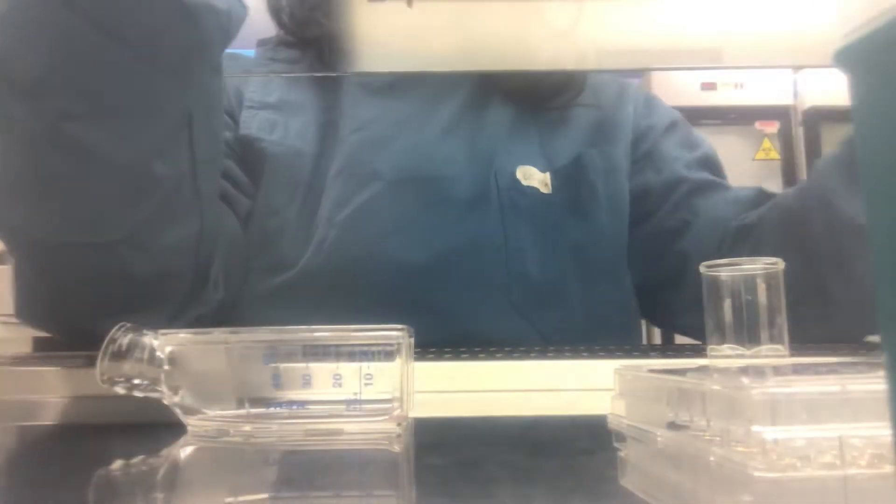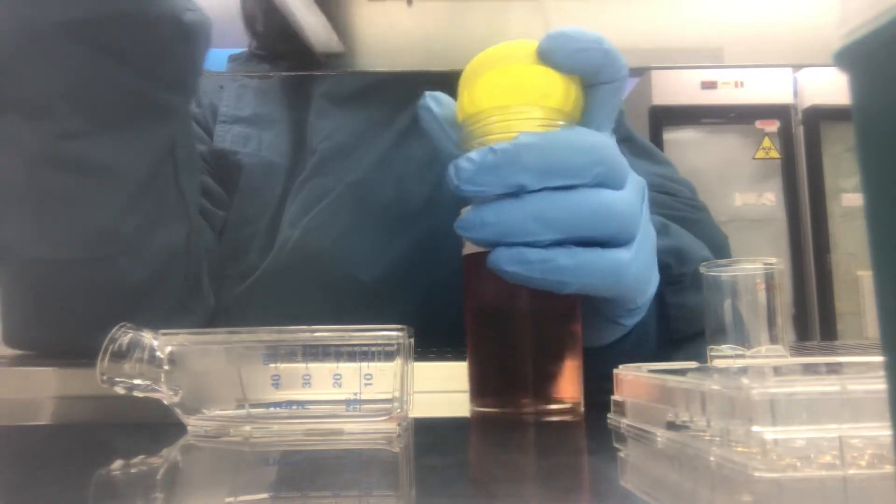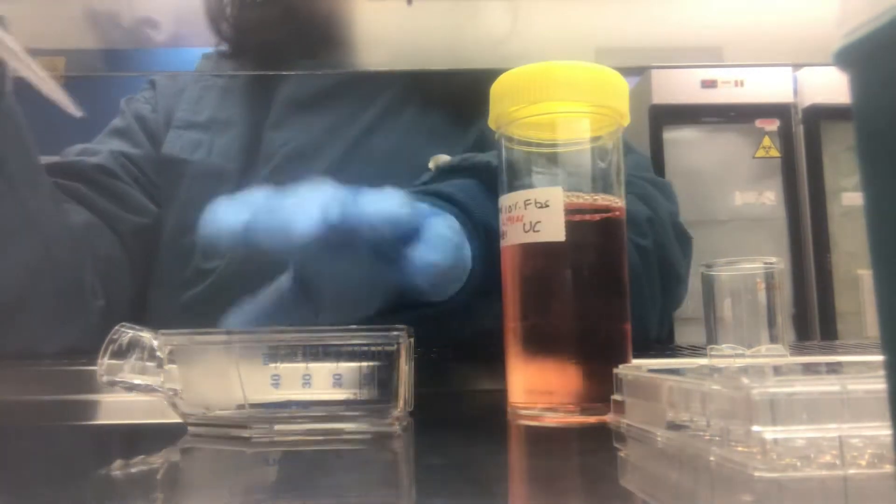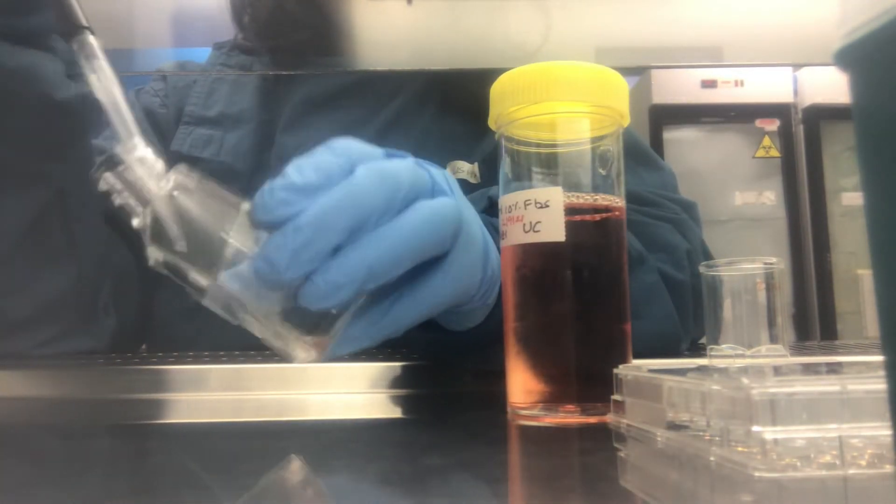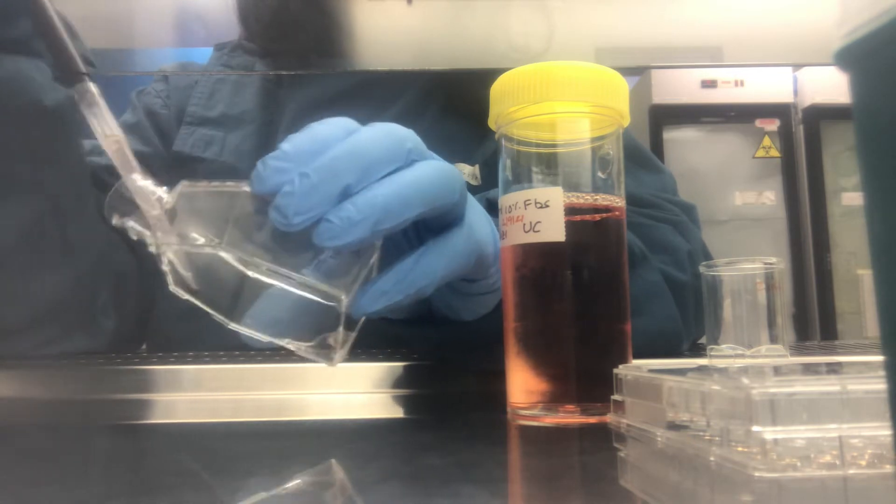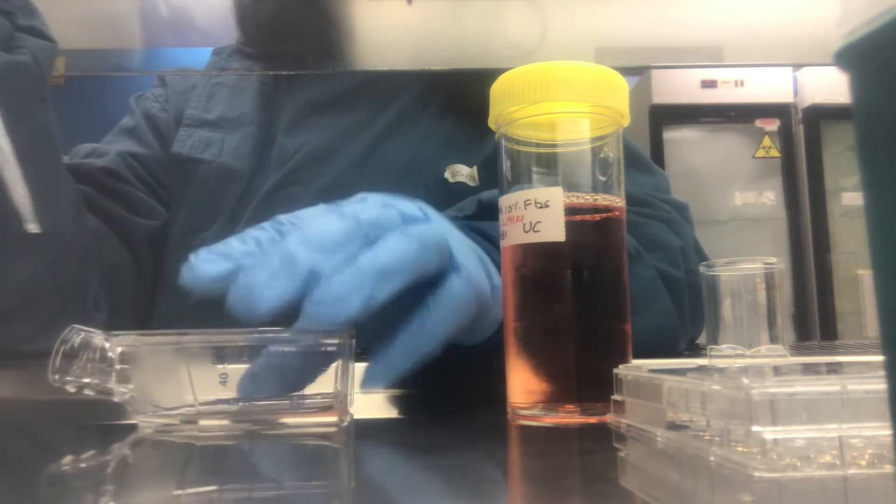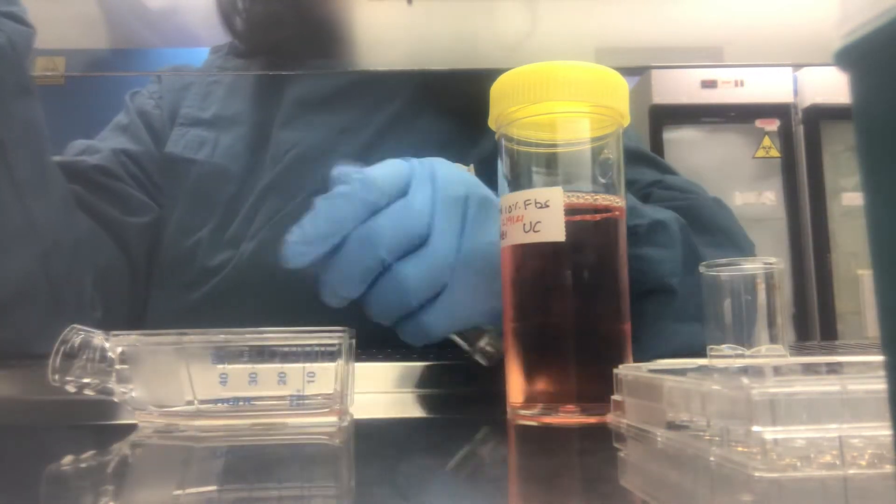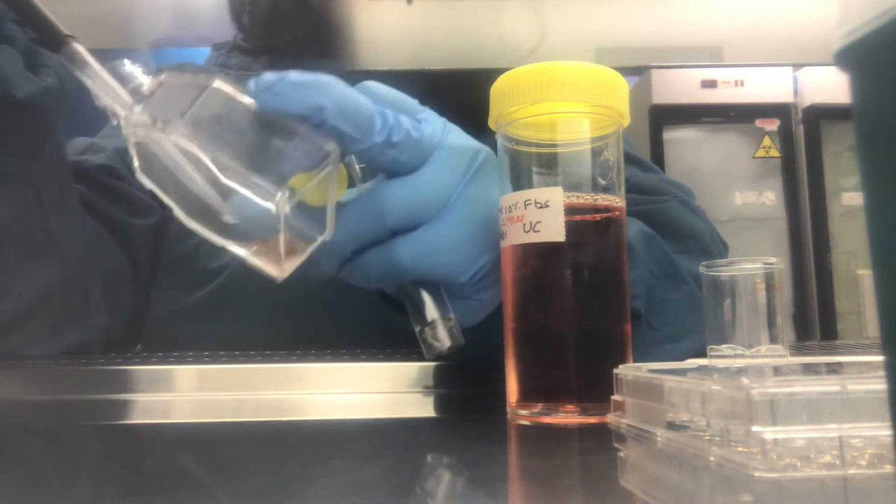Once you've confirmed that your cells got detached from the flask, add your media to neutralize the trypsin effect. Just rinse the surface area to detach all the cells out. Now I'm collecting these detached cells in another tube so that I can centrifuge it to pellet the cells.